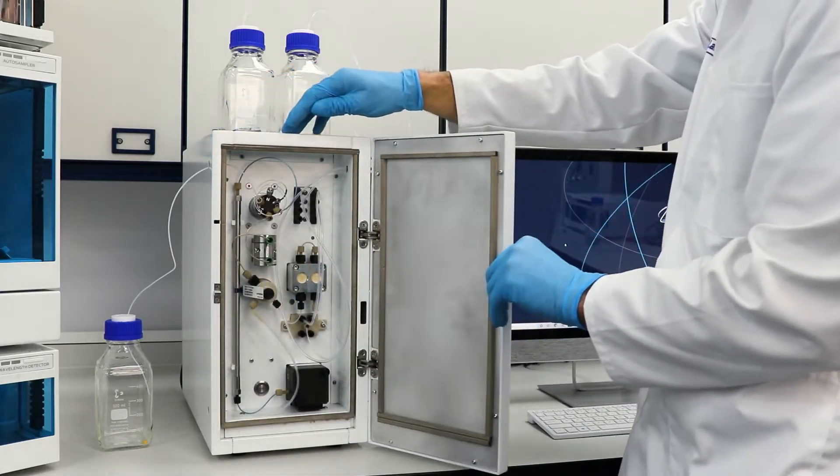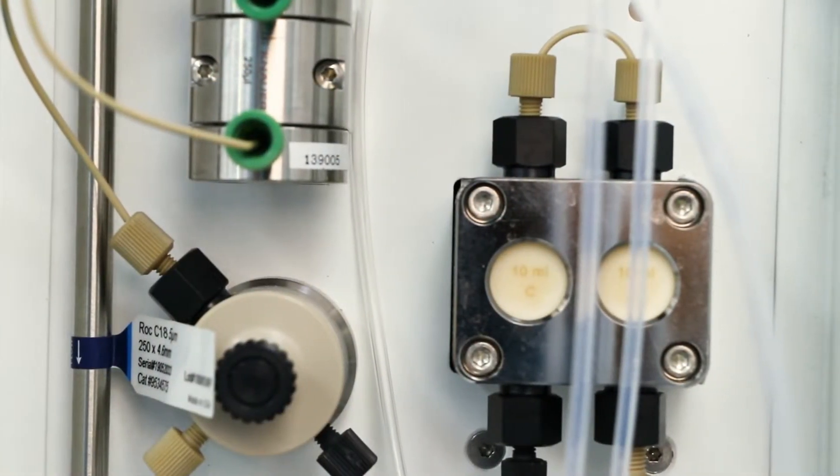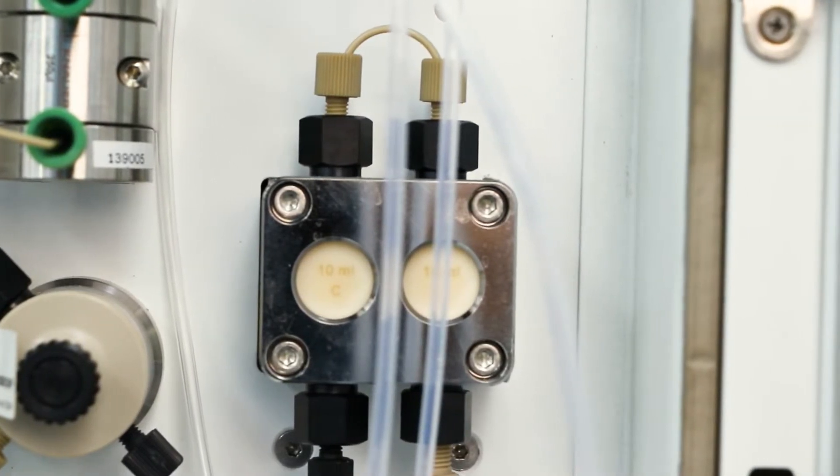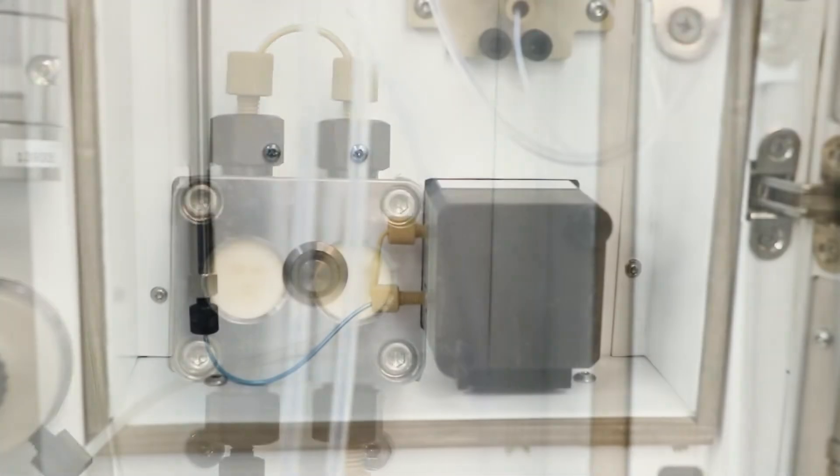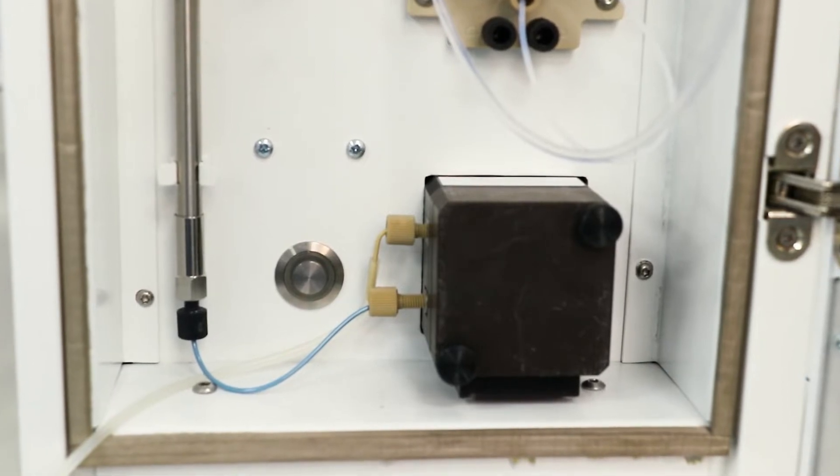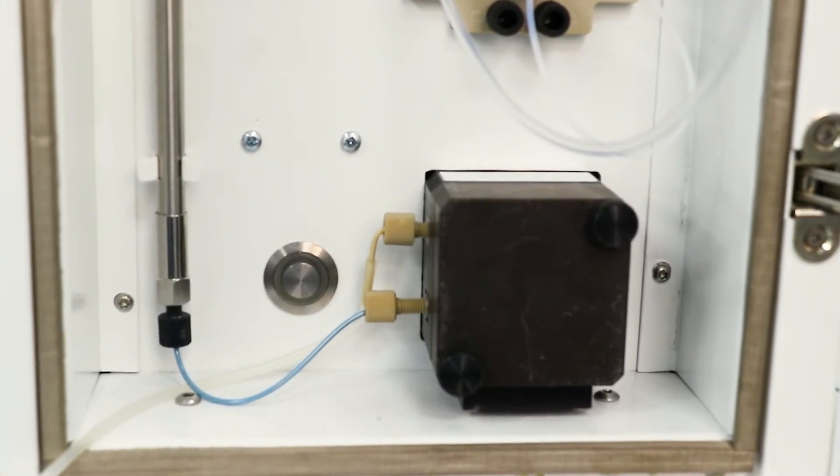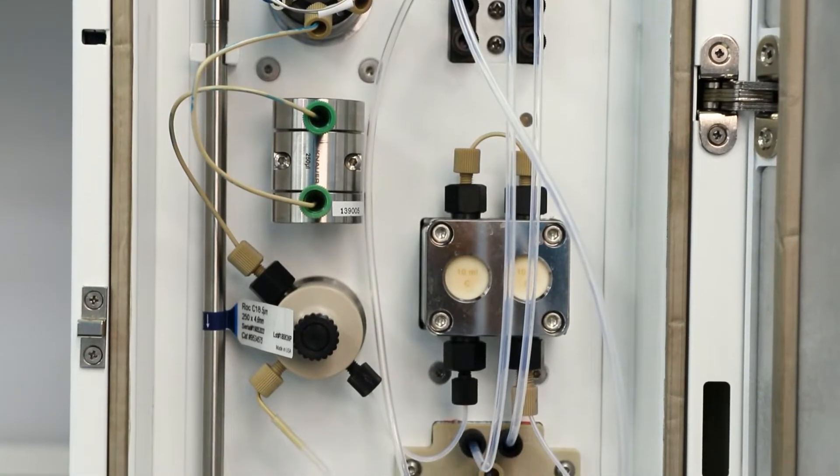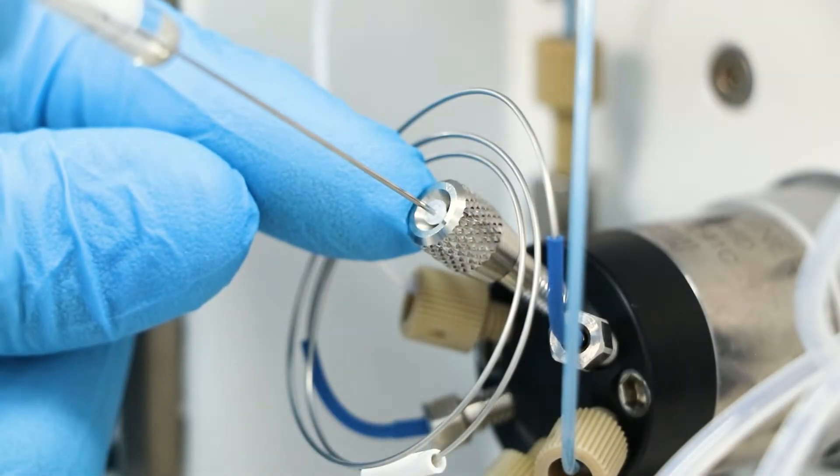This includes a low pressure gradient quaternary pump, which allows for the delivery of up to four solvents for maximum flexibility, a UV detector, the most commonly used cold chromatography detector, a radio detector that is based on LabLogic's proven flow ram solution, and a manual injector.